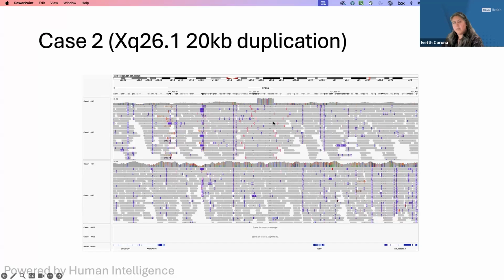We didn't know if it was going to be there. When we were doing the analysis, we had the long read to do a genome-wide analysis, but we went directly here and saw it. And it's a duplication that was very clear. So in the publication, they mentioned that even though it is closer to the gene on the right, it actually affects expression of this gene, ARHGAP36.